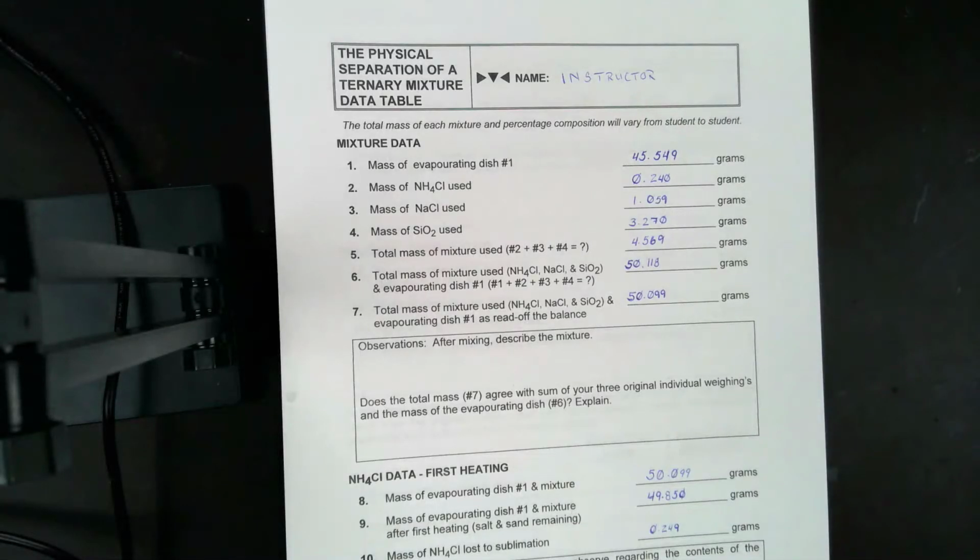So I took the evaporating dishes with the salt crystals and the sand off of their respective heating elements. I let them cool, and then I weighed both dishes with their contents. So I'm just going to really quickly walk you through the data sheet, where everything goes.